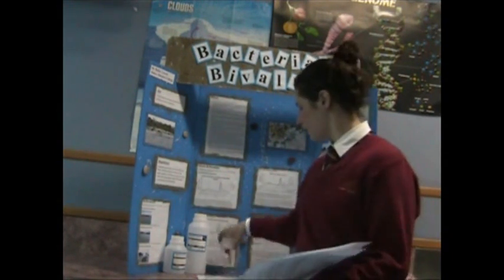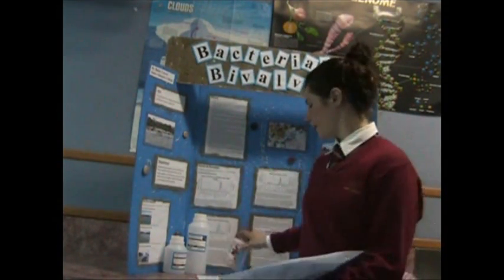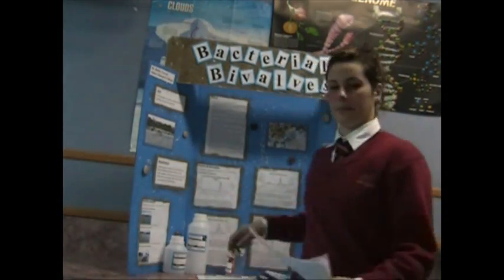During my period of 30 days sampling, I followed a set method. Each morning, I would go to Environment Southland and gather my field gear, such as sampling bottles used to collect the water, a YSI meter used to record physical data of the water conditions and weather conditions in the areas, and field sheets, such as this one, which were used to record the data and relate it back during the results process.